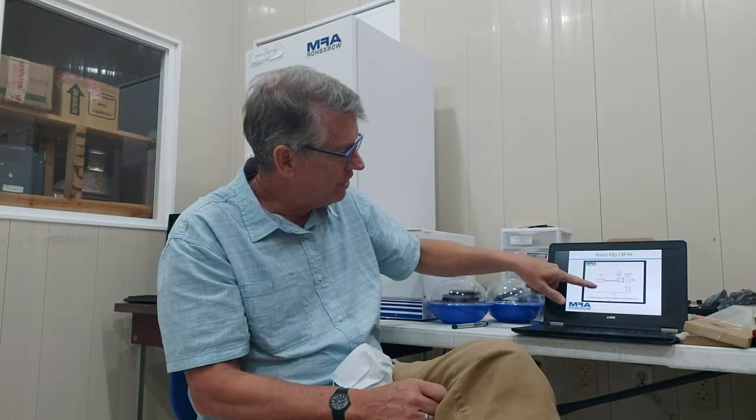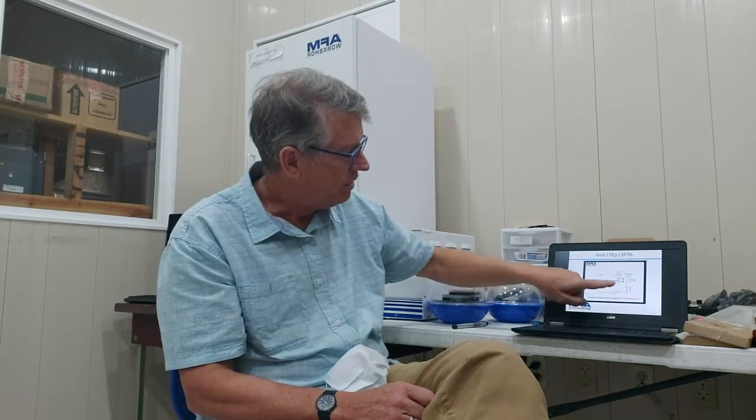Now, I can make a position-sensitive device with two photodetectors. I have a top one and a bottom one. Can you see this okay? So we have a top detector and a bottom detector. And the laser goes up and down and shines on the top one and the bottom one. And we take the top photodetector and the bottom photodetector and we subtract them with a circuit. So the output of that starts at 1 volt. It goes down to -1 volt. That's when the detector goes from the top to the bottom. Okay, so you see the voltage? 1 to -1. What's really interesting is at the interface there, the light is a little bit on the top and a little bit on the bottom, and we get a slope.